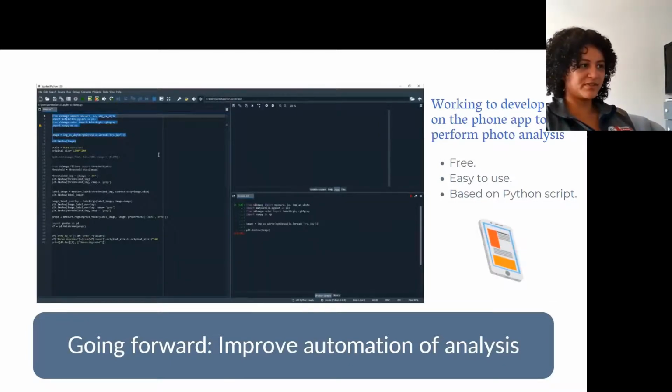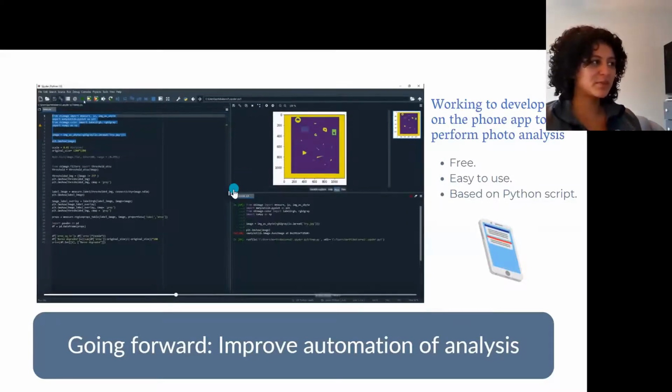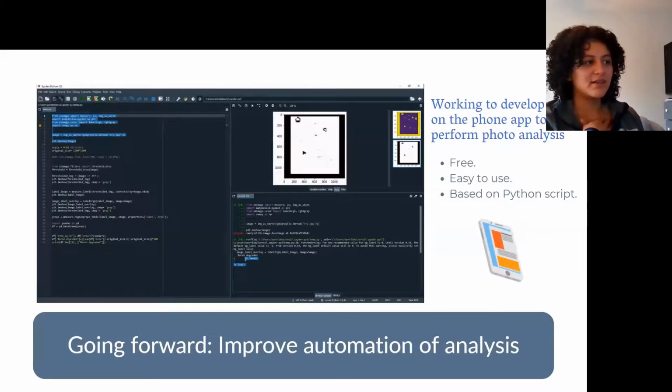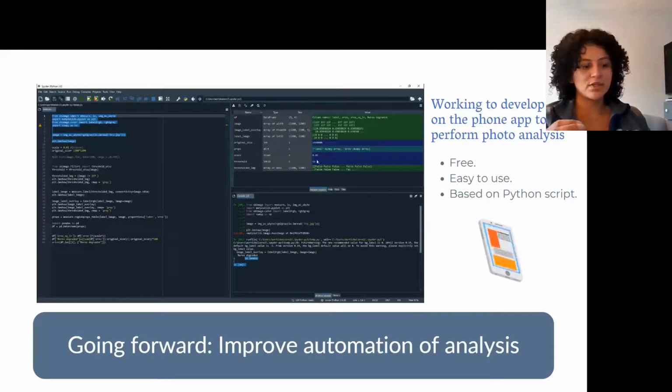And he actually left a video here where he was trying to implement the same basic commands with Python. I'm not an expert in Python, I've never used it, but he tried putting a code in Python, and what it does is it assigns a number to each category of color in the image. So when you take an image, it will tell you how many pixels of a certain color there are.